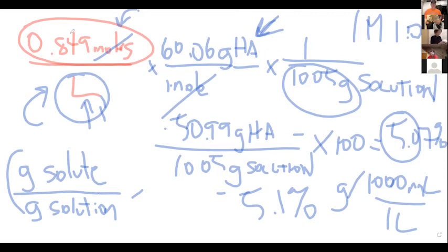Professor, for this, is it pretty close? Yeah. For the volume of vinegar, you just do volume equals mass over density. Did you want it in 2 significant digits because the sodium hydroxide is in 2 significant digits?